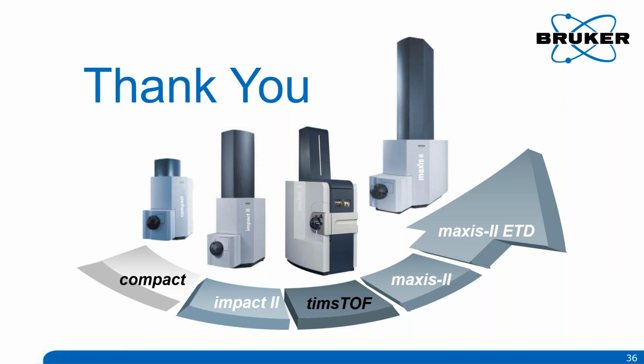Great, thank you. Really excellent presentation, Dr. Filipenko. We do have a couple of questions that have come in, so I'll get started with those. The first question: are there any issues with space charge effects in the accumulation stage of the TIMS cell?